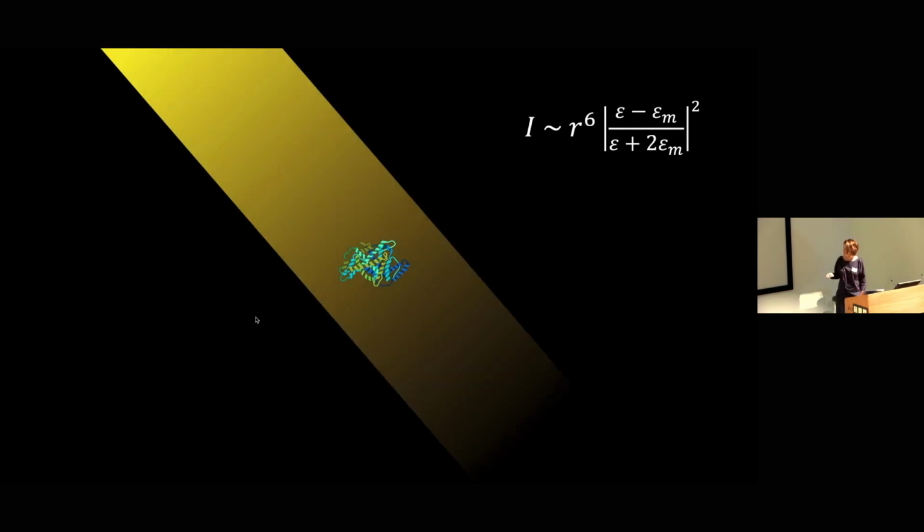But the reason is actually simple, because biomolecules are tiny. They are nanoscopic particles, and since the scattering efficiency scales with the 6th power of size, also the scattering efficiency depends on the optical materials of the particle, or differences between the optical properties of the particle and the environment, which for a biomolecule is nearly nothing. So when you shine a light on it, only a very small portion of the light is scattered.